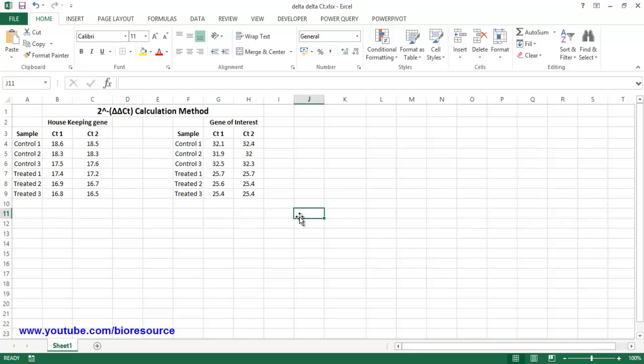Hello everyone. Today we will see how to perform delta CT calculation.